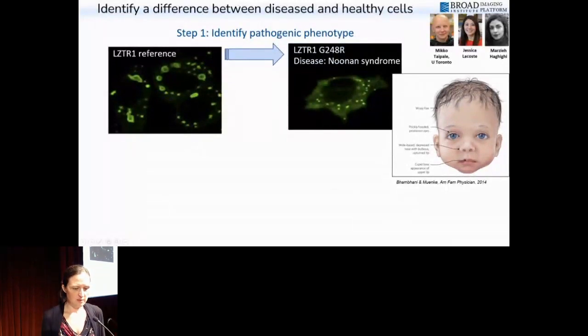And then when this mutation is present, this is just a single cell shown here, the nucleus is here, there's much more protein in the cytoplasm just hanging around loose, and the structure of these vesicles has changed quite dramatically to be much smaller. So clearly, we may have no clue what this gene product normally does. We may have no clue what the impact of this mutation is, but we can see a difference.